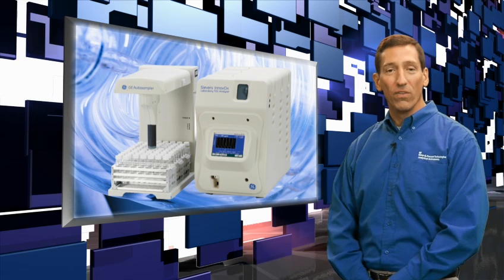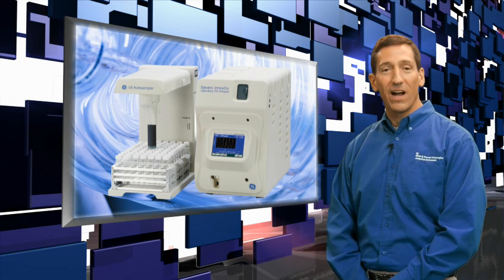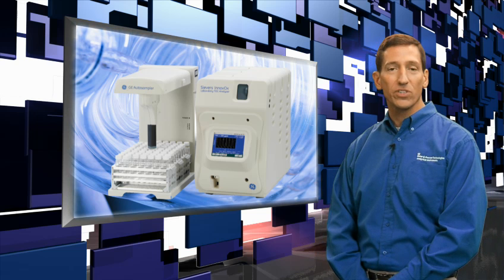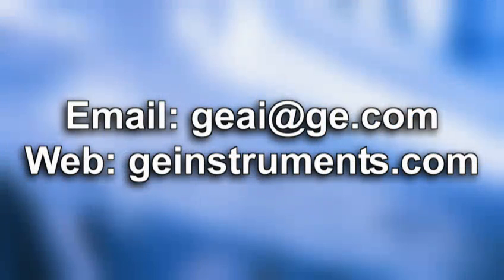This is just a quick overview, but it should give you an idea of how the Seavers Innovox offers a simple, robust, and affordable solution for your TOC measurement needs. Contact us today to schedule a free demo. Thanks, and we look forward to hearing from you soon.